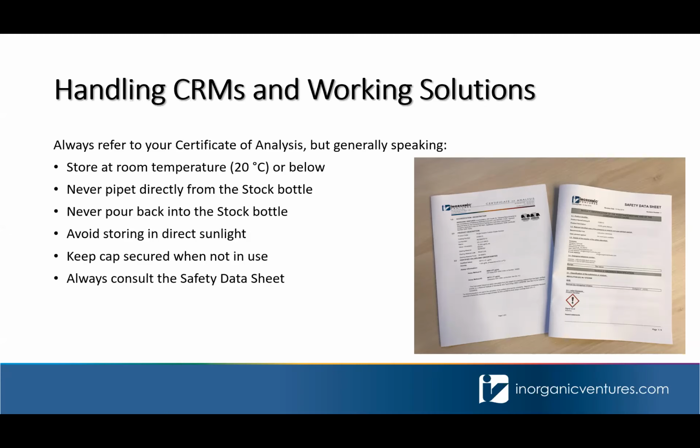This also prevents the oops factor. So your clumsy lab mate comes around and knocks your bottle over. You don't lose your solution. And it also prevents environmental contamination. So say a chunk of ceiling tile falls into your bottle. You wouldn't waste your expensive solution at that point. If you have any questions on the safety aspects of handling your working solutions or your CRMs, then you'll need to consult the safety data sheet.